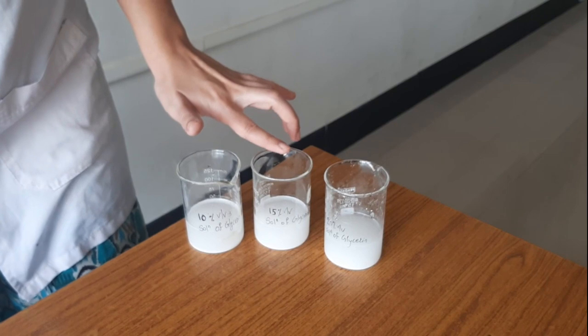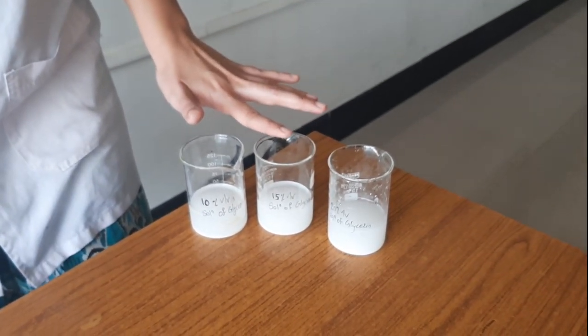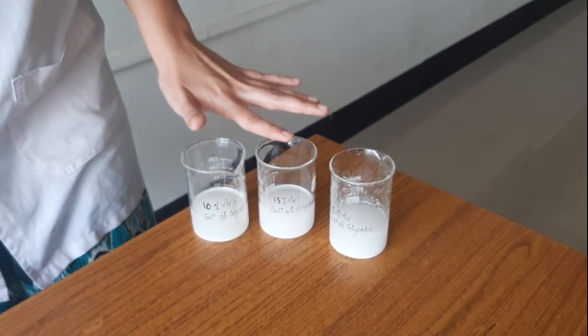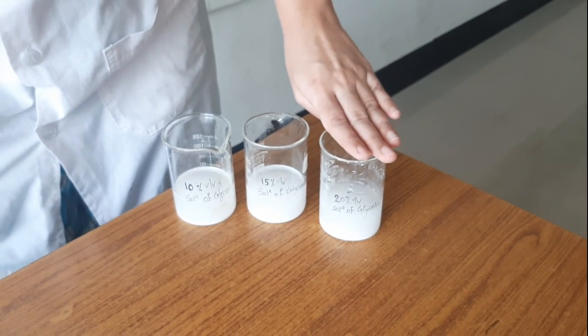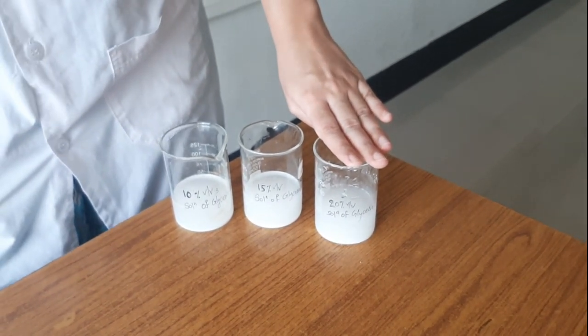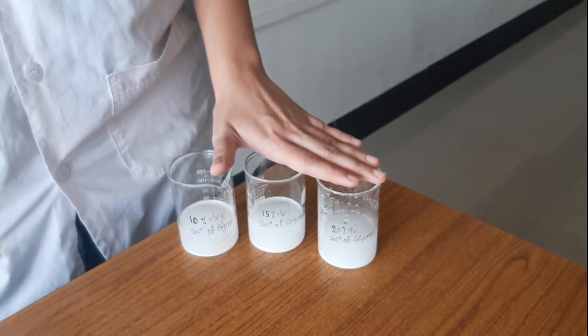Then the next is a 15% volume by volume solution of glycerine in water, from which we have prepared a 5% slurry of calcium carbonate. And the last one is a 20% volume by volume solution of glycerine in water, from which we have prepared a 5% slurry of calcium carbonate.